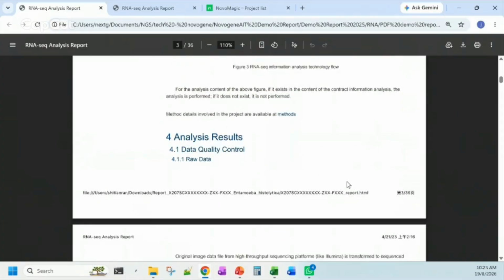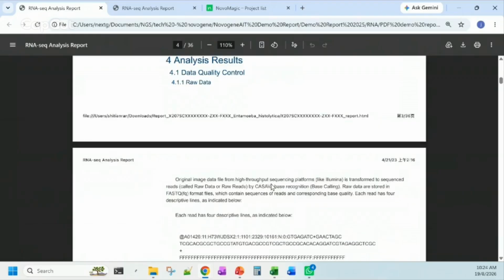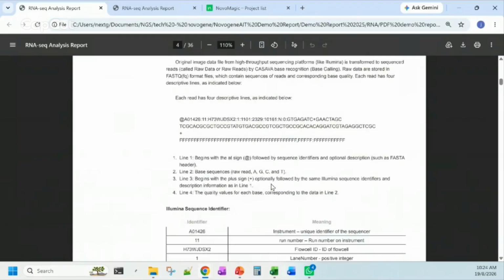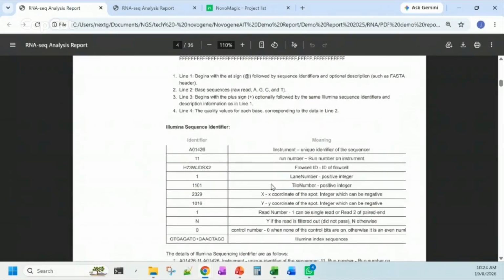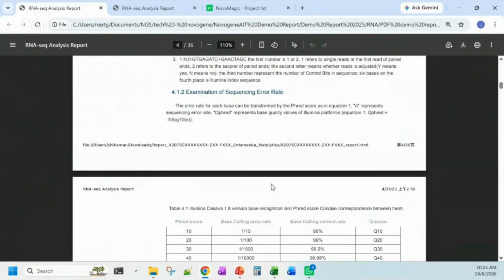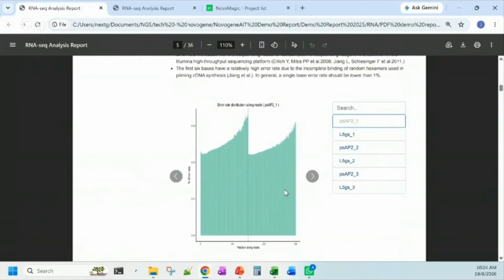So this is a quick overview of the analysis included. In this report, it includes the summary of all the analysis that has been carried out. But because this is only a report, the full data or full results normally come together with this report, but in separate files. So the tables that we are going to see in this report will not be the complete tables. I will show you examples later.